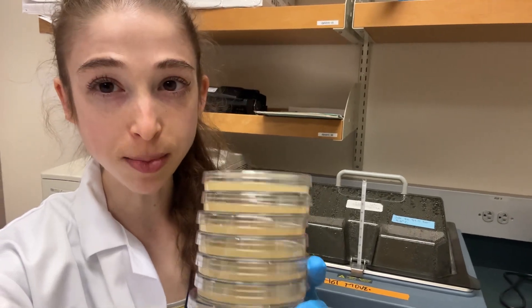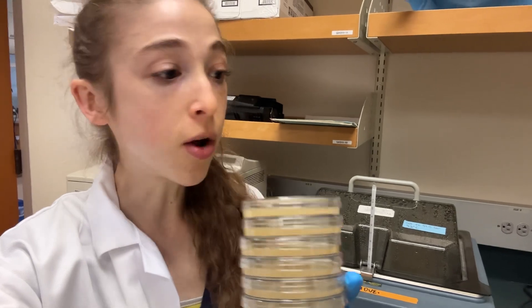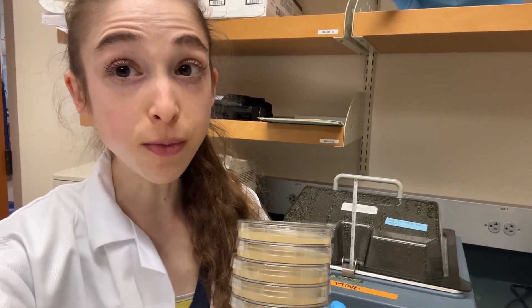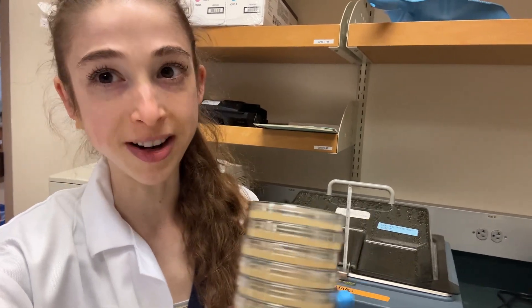Quick tip for when you're preparing LB agar plates. While you have the LB agar in the autoclave, go ahead and set a water bath to 55 degrees Celsius. Then when those bottles come out and they're super duper hot, stick them in the water bath and now you can safely forget about them.